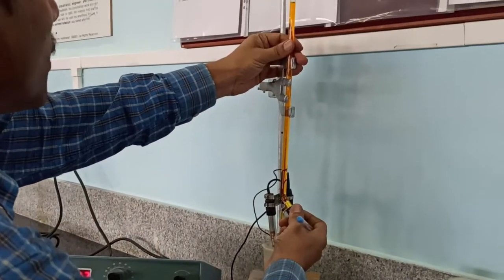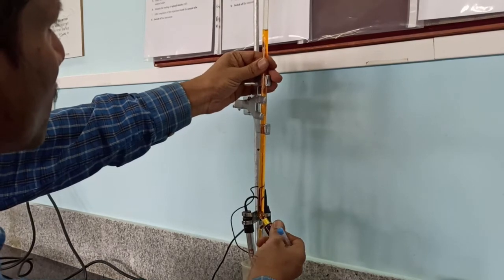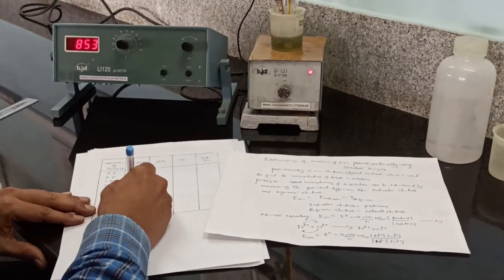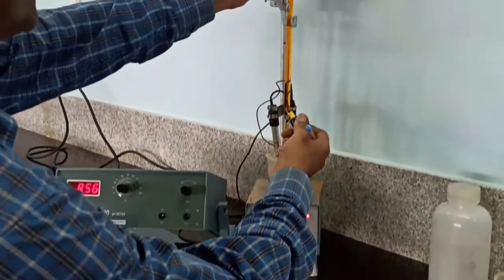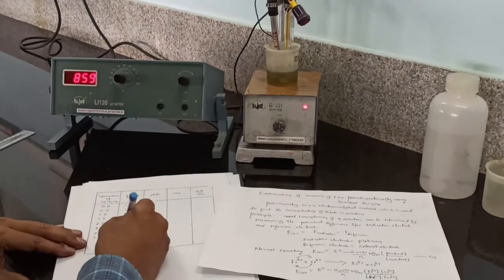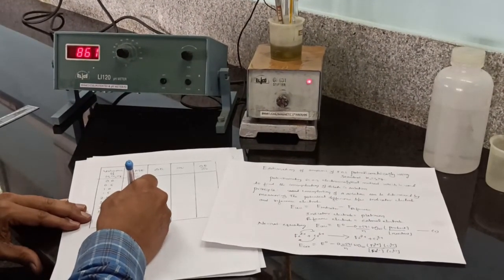After rapid rising EMF, take 4 more readings by adding an increment of 0.5 ml of potassium dichromate solution. At 3, the EMF is 854 or 55. At 3.5, the EMF is 861.